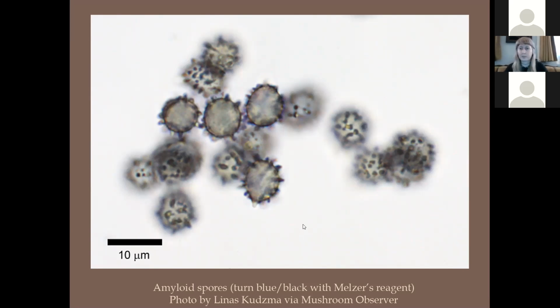Oh, to observe a spore sprouting. That happens so infrequently. It takes a while for it to happen. I actually have seen spores that were sprouting underneath the microscope, but maybe only once. You can see a little piece of hyphae coming out of it. But you can't watch it in real time because it takes too long. I don't know that anything you mount it in would make it so that you can't see the hyphae coming out, but that's just not something that you see that often. Cool.